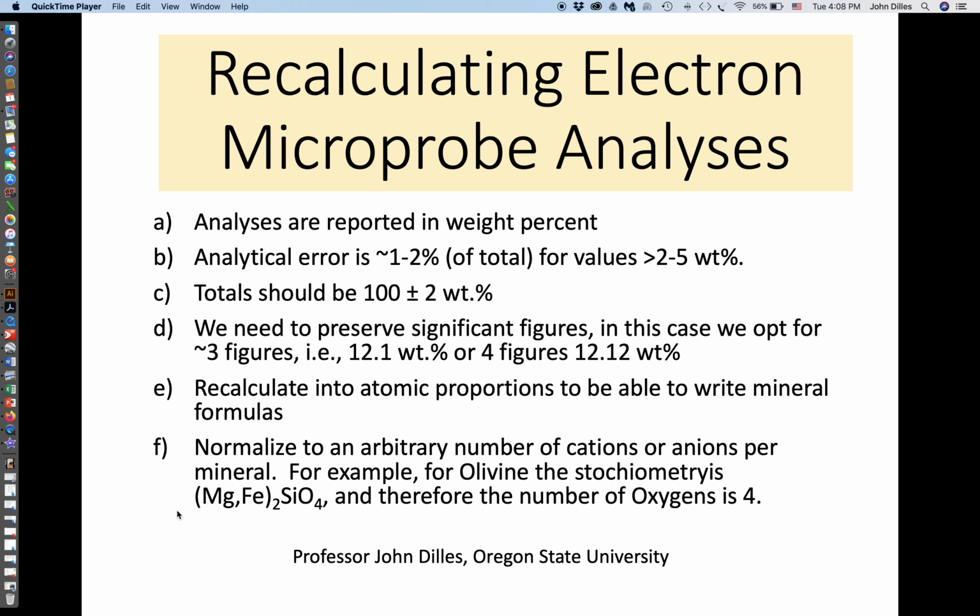We need to preserve significant figures. In this case, we opt for 3 figures, i.e. 12.1 weight percent, or 4 figures, 12.12 weight percent.